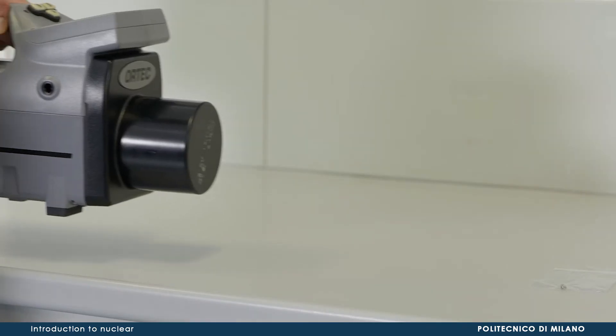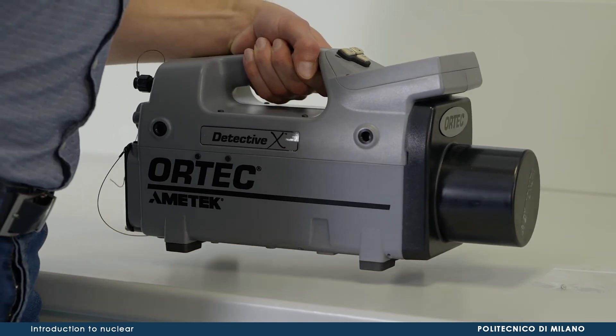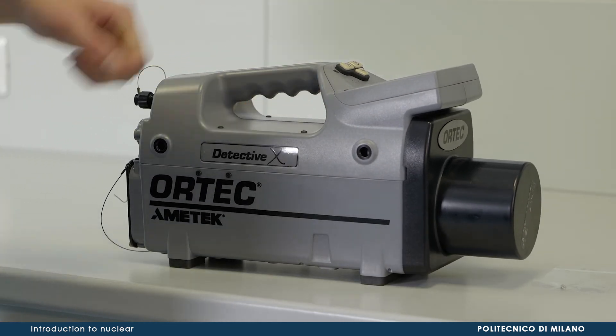Finally, we will use a third device, namely Detective X, to assess the in-situ identification of radionuclides. Detective X is a portable hyperpure germanium detector, specifically designed to be a user-friendly radionuclide identifier. To achieve a good level of manageability, the cooling of the hyperpure germanium crystal is performed by a Stirling cycle, so that no liquid nitrogen is needed.